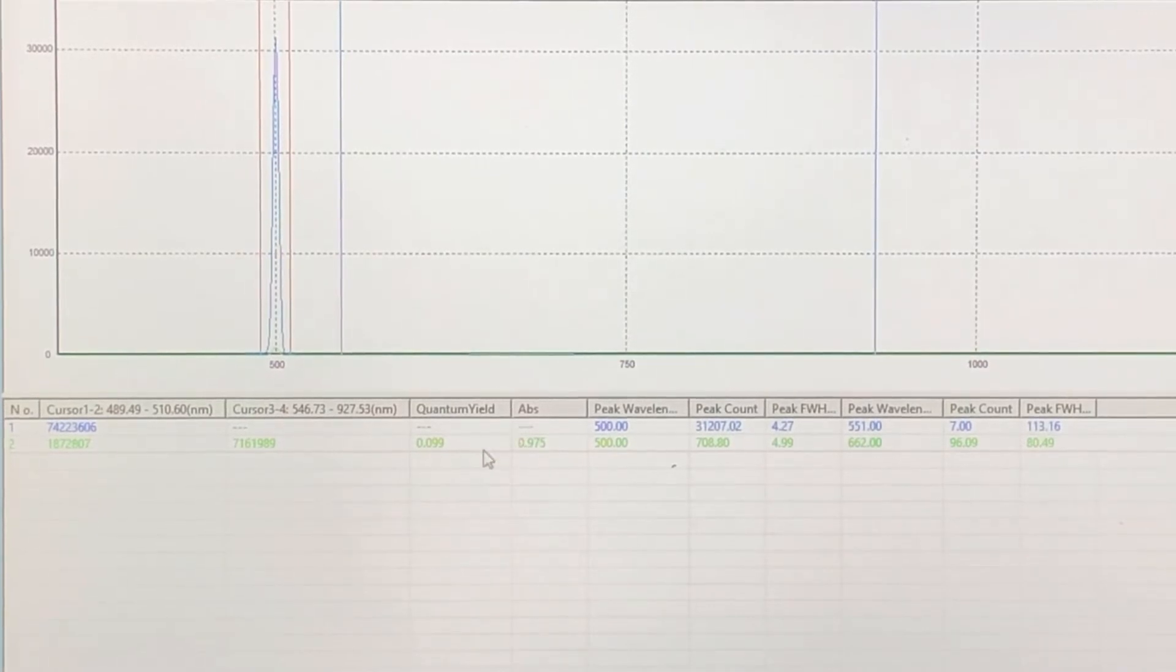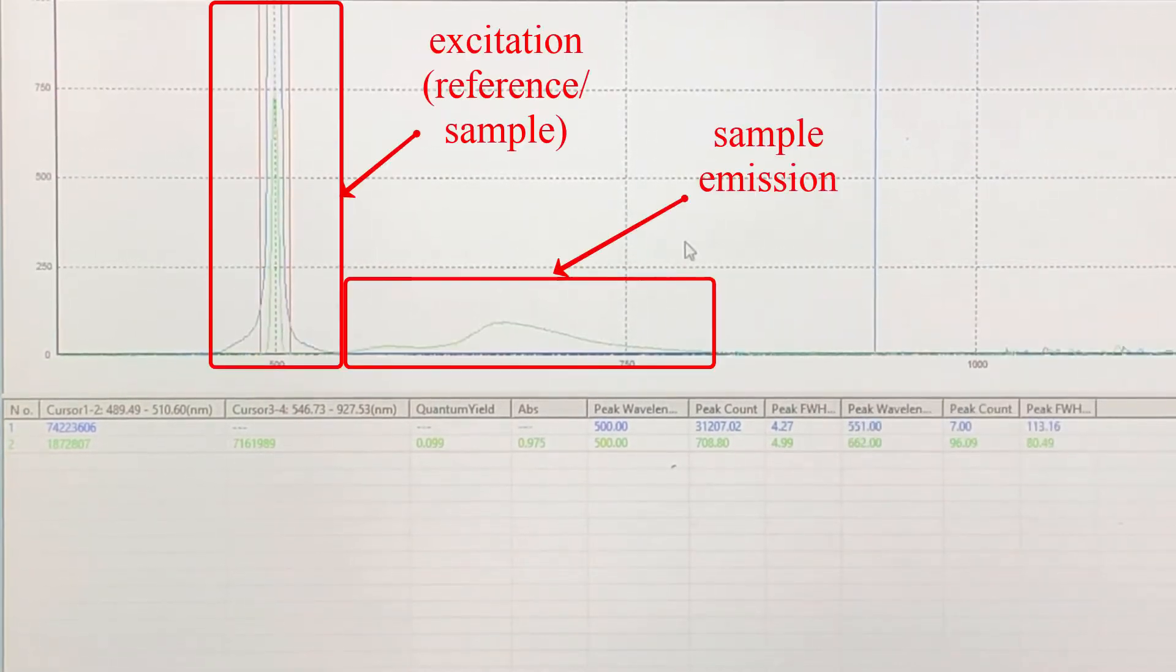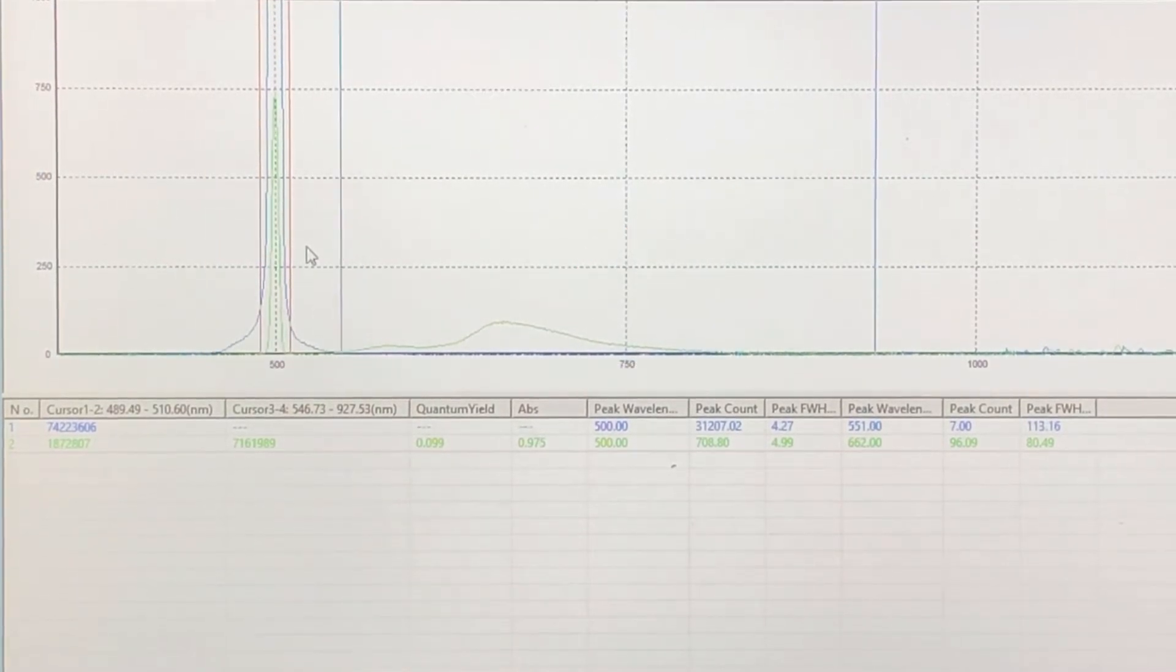After the reference is measured, the quantum yield is automatically calculated and you'll see it on the bottom line. Let's zoom in to get a better look at the data. Now you can see the excitation peaks from the reference and sample on the left, as well as the sample emission peak on the right.